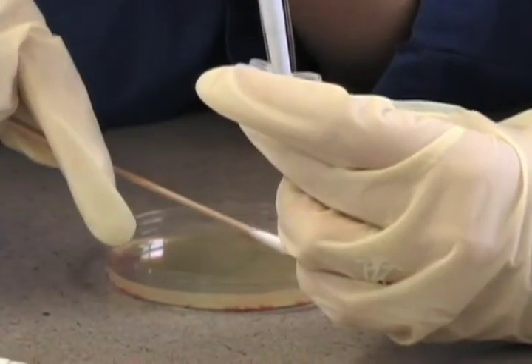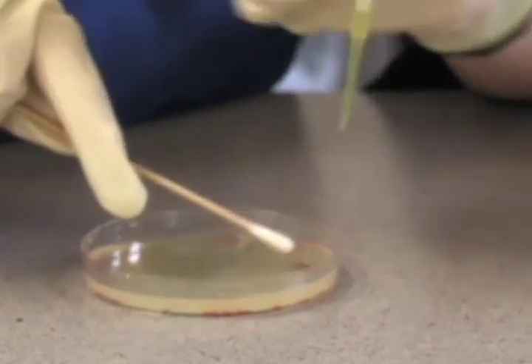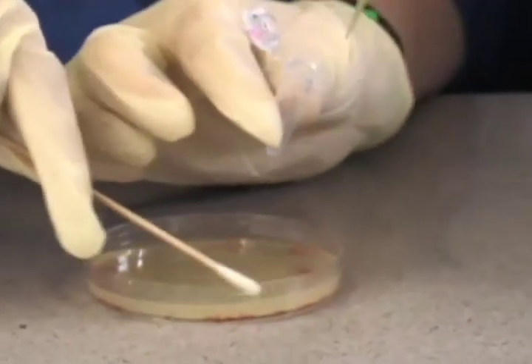Yesterday, we used site-directed mutagenesis to mutate specific sites on a GFP plasmid, and today, we will transform the mutated and unmutated control plasmids into bacteria.